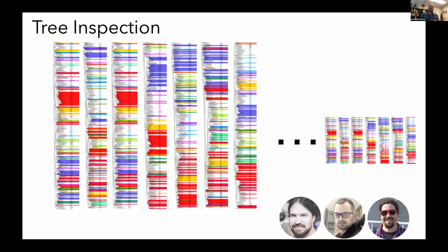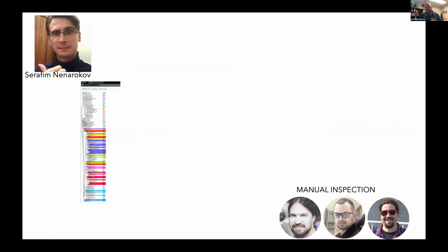Once we have collected n number of hits from various organisms, and we've done this from all 305 taxa, we've realized that we actually can keep the paralogy in these data sets. And then we're able to actually ask some questions about paralogy and include those paralogous sequences. What we realized very quickly is that looking at these trees is very difficult if you were going to look at them in FigTree.